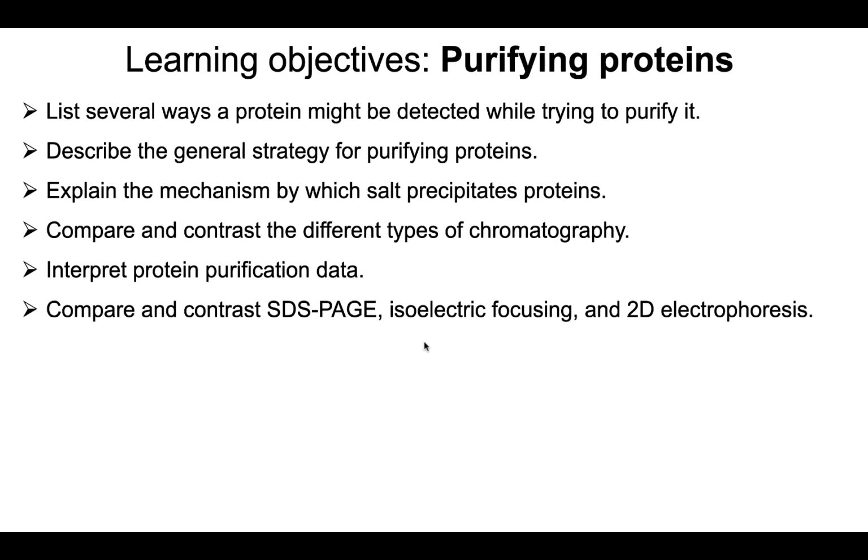In this video, we're going to discuss some techniques used to purify proteins. And by the end of this video, what I'd like you to be able to do is to list several ways a protein can be detected while trying to purify it, to describe the general strategy for purifying proteins, explain the mechanism by which salt precipitates proteins.